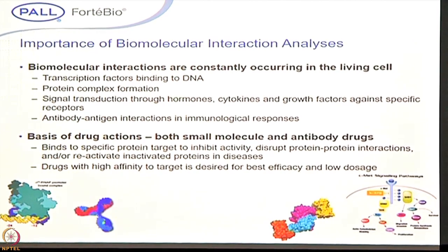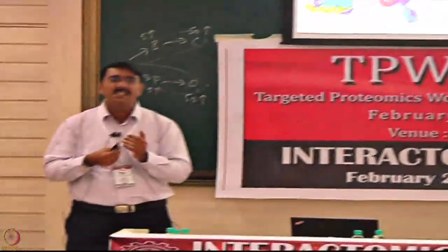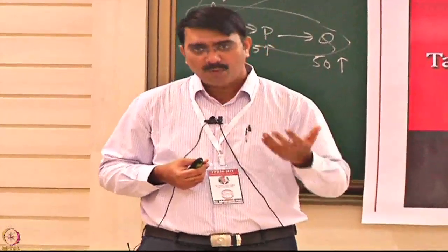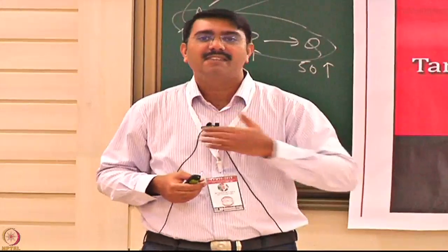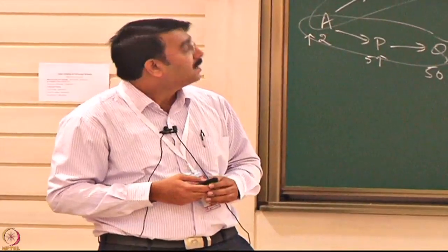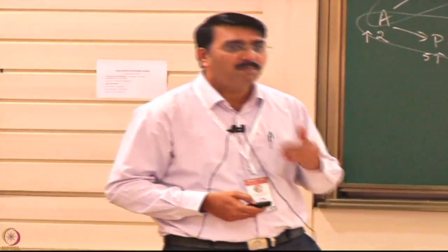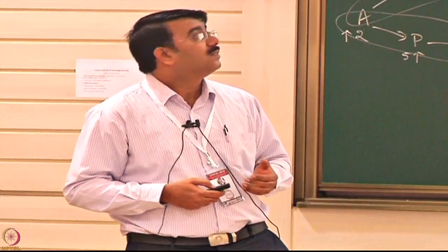If you have a target and any molecule you have discovered binds to it, how strong is the affinity? If the affinity is strong, then you require a lesser amount of the drug. If the drug is clearing from your body very fast, then you require more doses. So this will be helpful in your drug discovery areas. When you look at all the systems, interaction is a very important phenomenon, so we need to understand and characterize it.